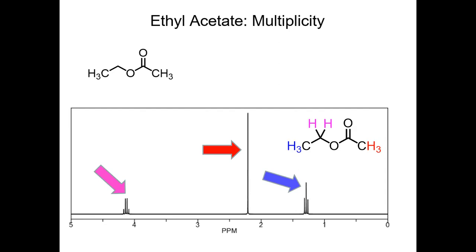All right, let's do the red protons right here. How many hydrogens are on the neighboring carbon? Right here. How many hydrogens are there? Or are there any hydrogens there? Would it be 3 since the CH3? No, we're looking at these.